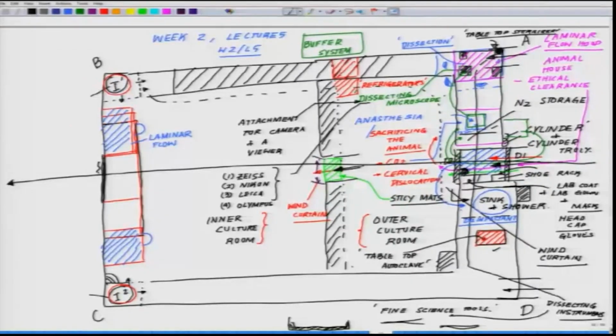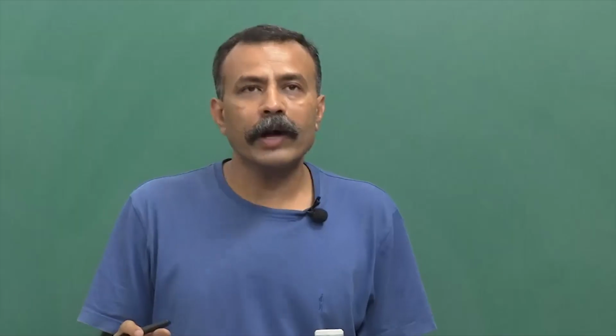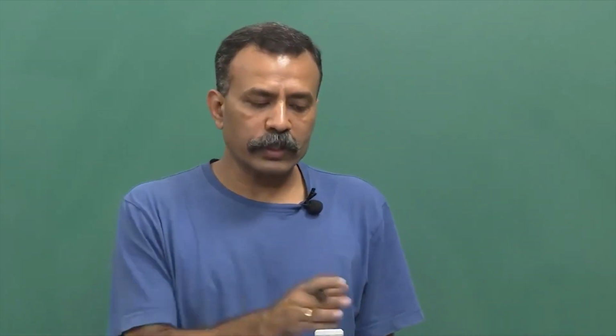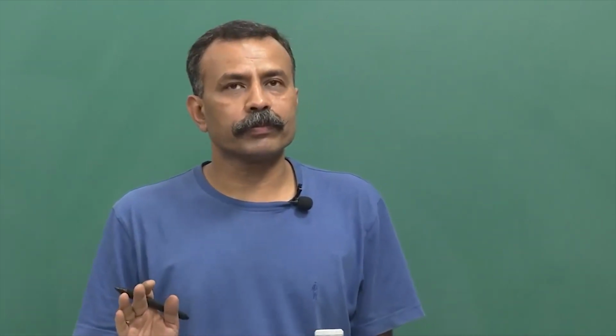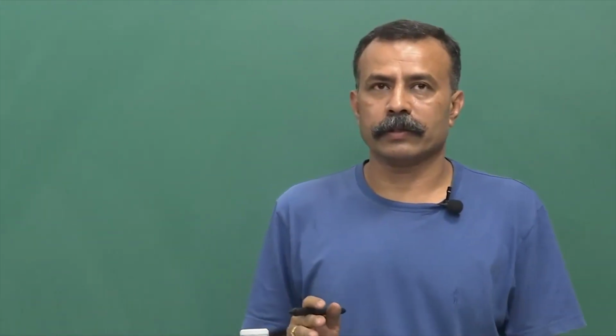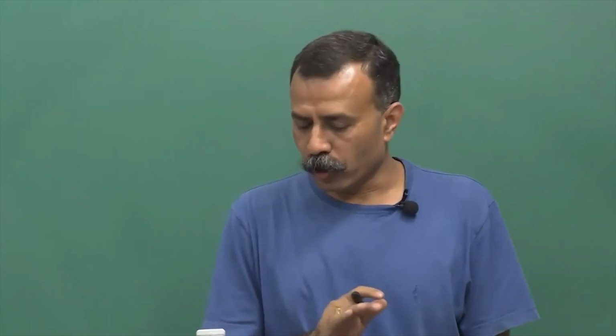I'm not putting any of the major pieces of instrument which will come in the way of the air current. Try to avoid this as much as you can. Do not prefer to keep anything which is coming in the way. It's very widely advised that you minimize that as much as you can.